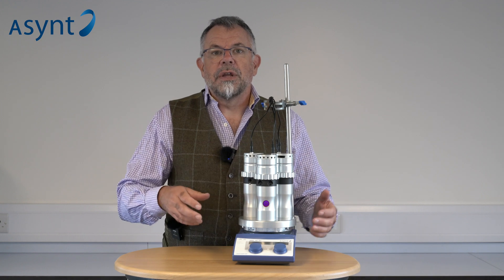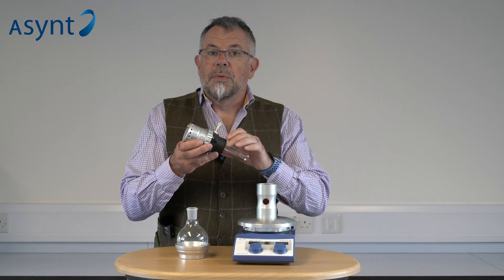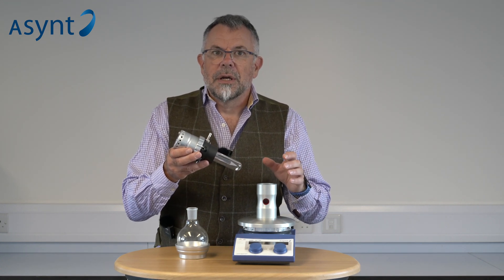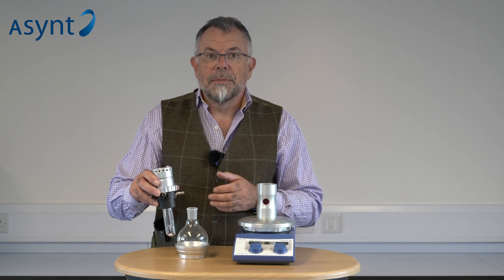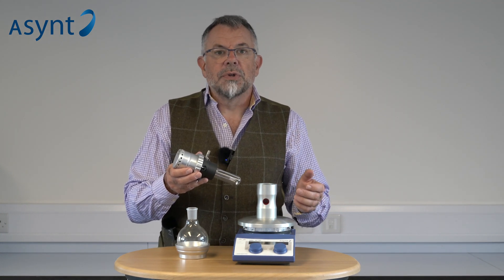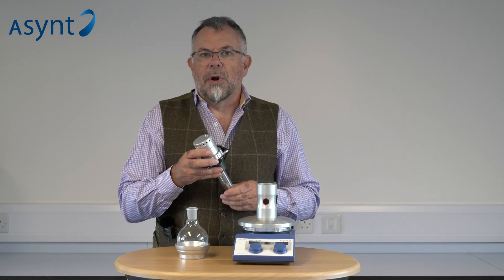Lighthouse will allow for a wider range of operation. The tube we use has a standard GL thread — we can make this in different diameters, and the quartz rod, the light rod itself, can be made to almost any length you wish. By changing the vessel on here, we can have smaller diameters, bigger diameters, or even a round-bottom flask adapter. The rod itself can be a length of your choice for your reactor vessel. For instance, there are many parallel reactors out there that use a 24mm diameter tube — if we know the length it needs to be, we can manufacture Lighthouse to fit your current parallel reactor system.